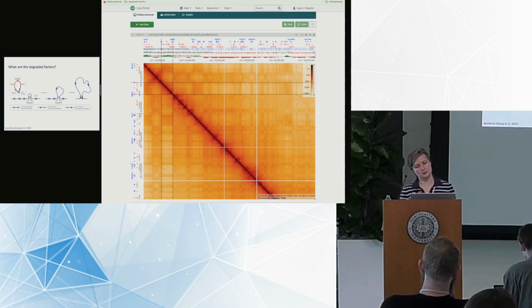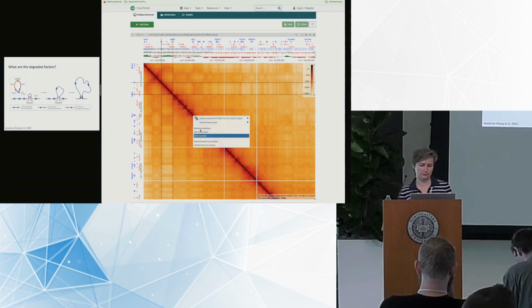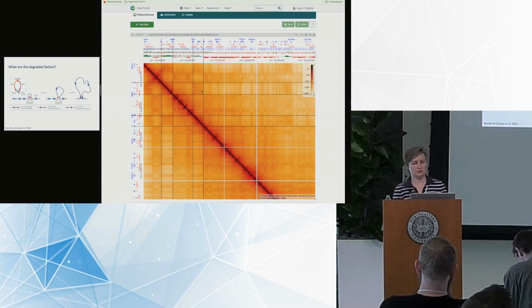So you can see this domain is interacting with other regions in the genome in a preferential way. So it likes to interact with this one, for example. I will mark its boundaries. You can see there is a preferred interaction between this block of genome and this block of genome. And there is an enriched interaction block at their intersection in the Hi-C matrix. However, the same region doesn't interact with the one right next to it. And you can see this blank square or white checkerboard pattern.